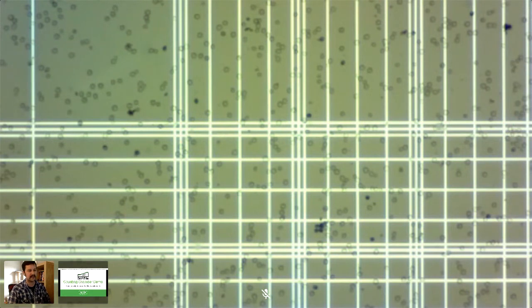You can't tell if it's blurry or the stream is blurry. Yeah. So this is, there we go. Yeah, this sucks. Okay. So I don't know how much actual cell counting I'm going to be able to do.